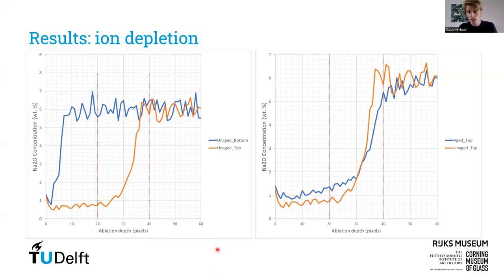If a microclimate is created between the glass and the wood, and this contains acidic volatile components which are known to be emitted by the wood, the glass degradation must have taken place much more quickly than on the side of the glass exposed to the air. Another factor that may influence the degradation rate is the potential manufacturing process. If one side of the glass was exposed to a different finishing environment, for example, than the other, that may have affected local glass composition and thus the susceptibility of the glass to deteriorate.